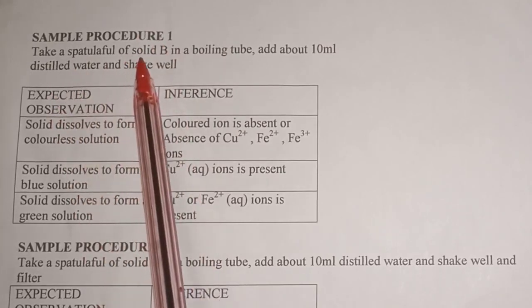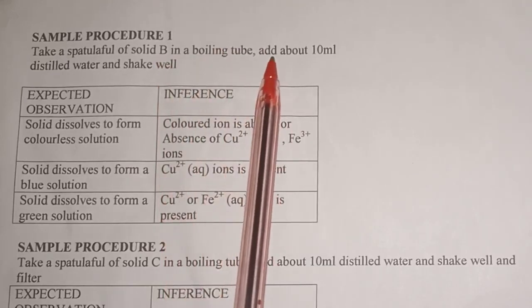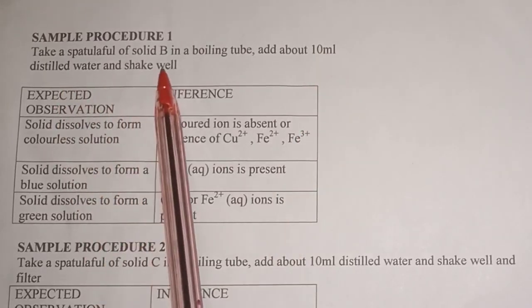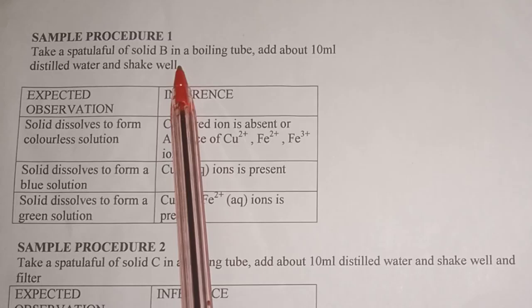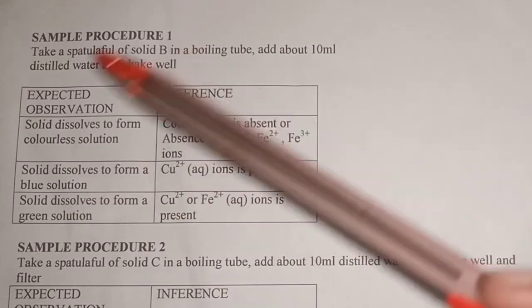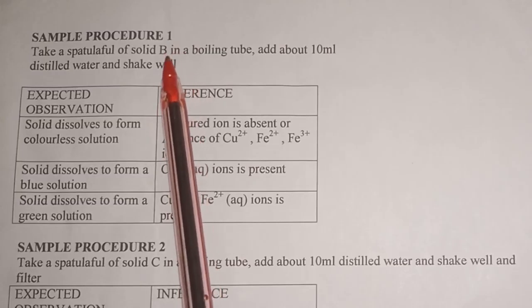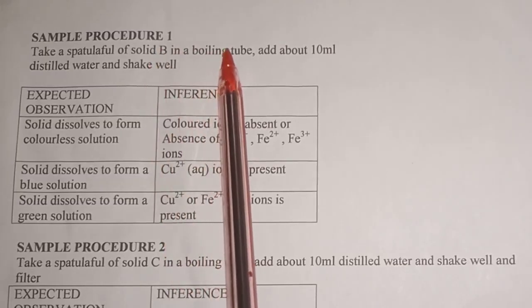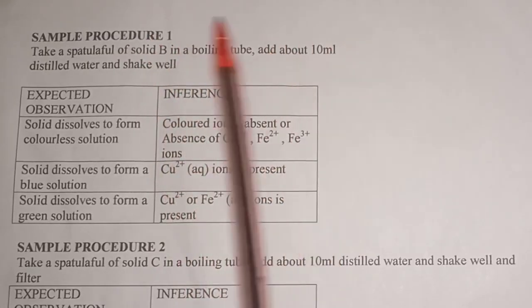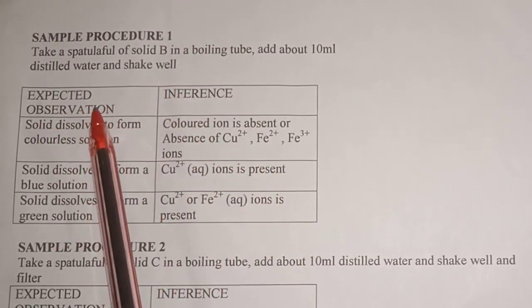You have here sample procedure 1: take a spatula full of solid B, an example, in a boiling tube and add about 10 milliliters of distilled water and shake well. Now expected observation: remember you are taking a solid, putting it in a boiling tube and adding 10 ml of distilled water, and you shake the mixture. The observation you can get is this solid may dissolve in the distilled water to form a colorless solution, or this solid may partially dissolve in that water to form two layers, maybe a colorless filtrate and a white residue.